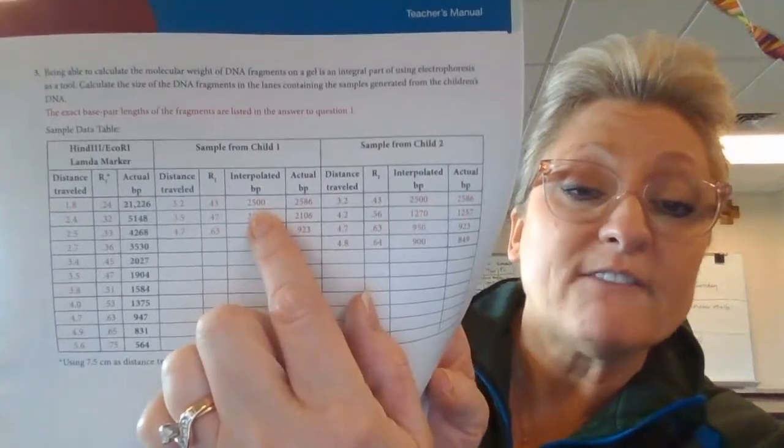So then I would go back and say my interpolated value is 2,500 base pair lengths. And I do that for all of those to get my interpolated base pair lengths. At some point you might have to use what is called a log 10 logarithmic graph, like the one you used right here. In the future, you would use some known factors, create a best fit line, and then interpolate your own data. It's not necessarily always base pair lengths; it can be anything in math or statistics. So that's how to do that.